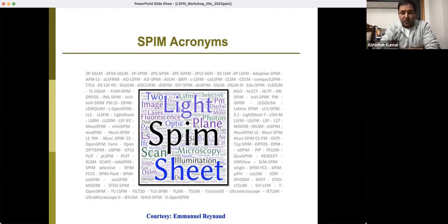We just hosted a light sheet conference and workshop last week here, and for fun, we did this acronym quiz game where we said an acronym and quizzed people on whether they could come up with the full name of that microscope. By and large, it was very difficult because there are so many acronyms and we can't keep them straight. But this illustrates how this field has exploded, how many options we have. And there is a good reason why we are all invested so much in this modality.